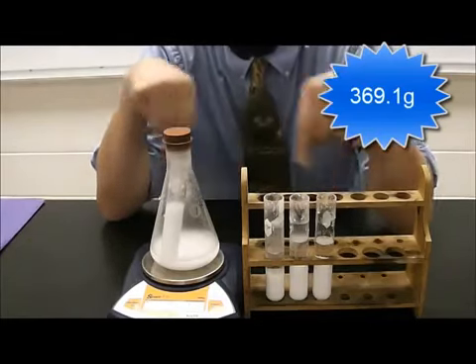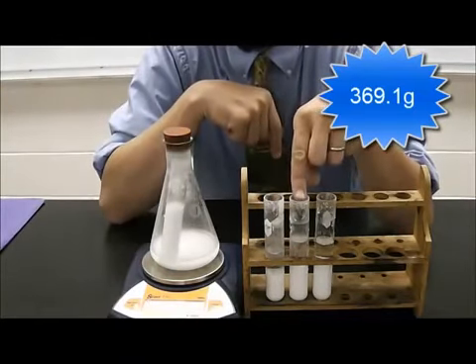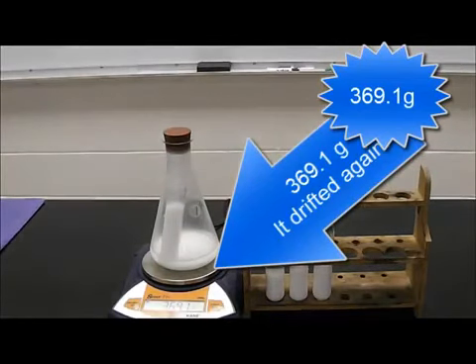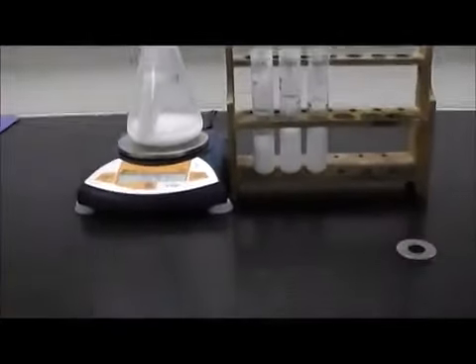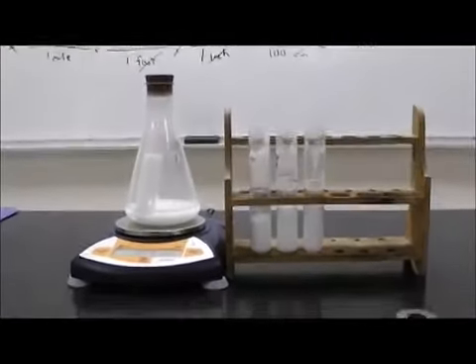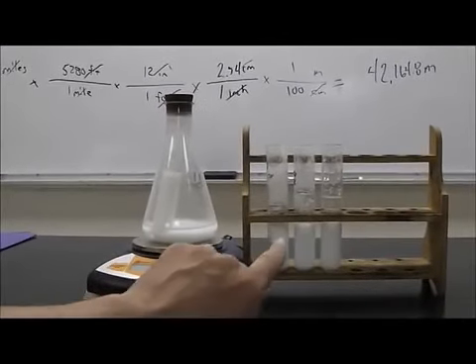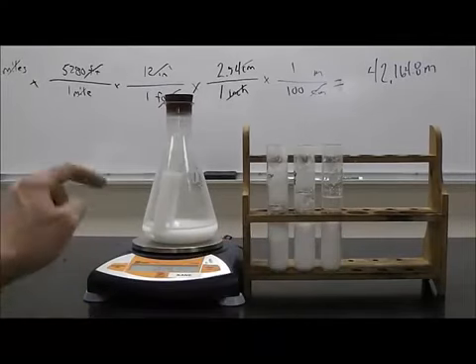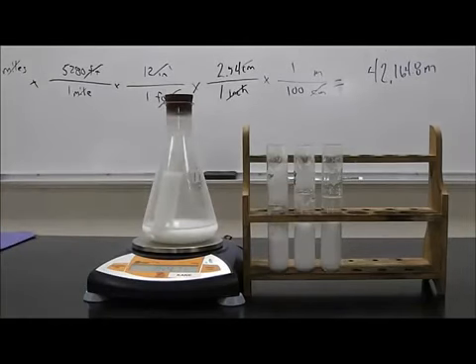I'm going to go ahead and get a close-up of these so that you can see. Freshly done, 6 hours ago, 4 hours ago, 2 hours ago. As you can clearly see, 6 hours ago is lower, 4 hours ago, 2 hours ago is a little bit higher, and right now you can just barely start to see that the precipitate is occurring here. We're getting a slight colorless solution at the top.